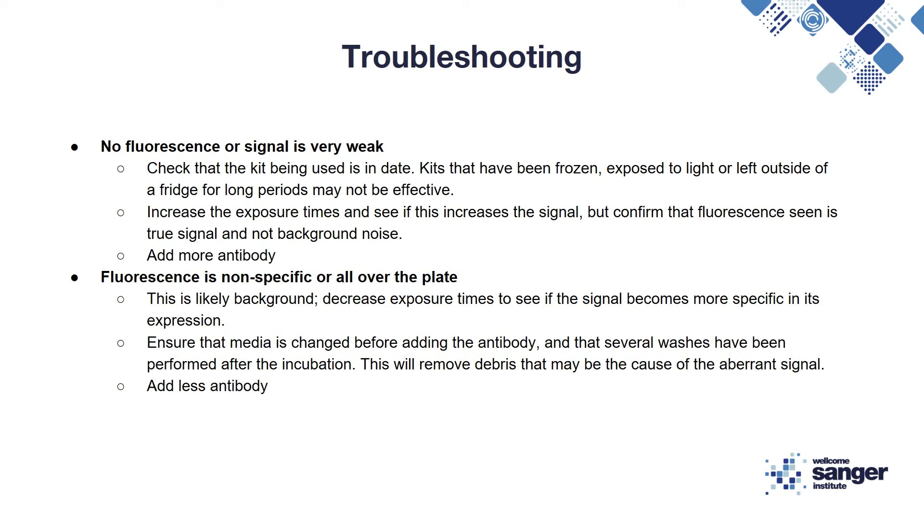If on the other hand the fluorescence you see is non-specific or all over the plate, this is likely background signal. Try decreasing the exposure time to see if the signal becomes more specific in its expression. Also ensure that the media is changed before adding the antibody and that several washes have been performed after the incubation. This will help to remove debris that may be the cause of the aberrant signal. You can also try decreasing the concentration of antibody.